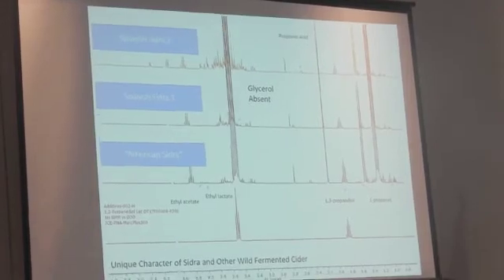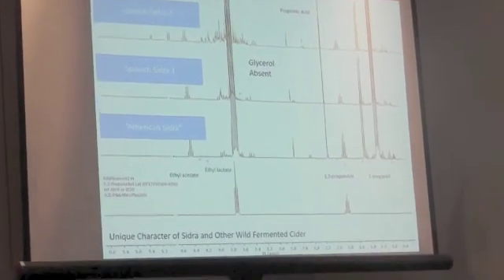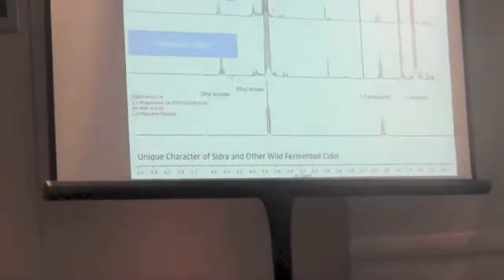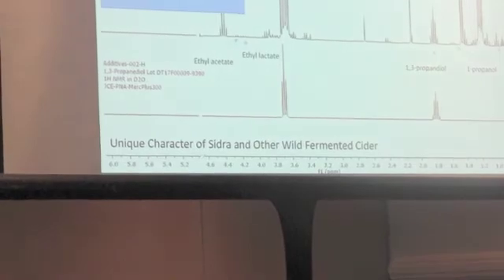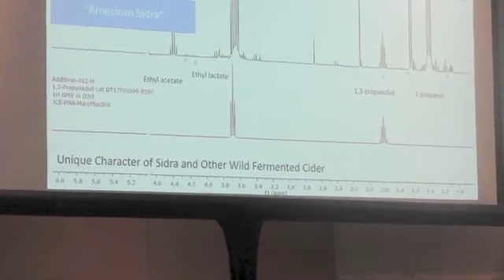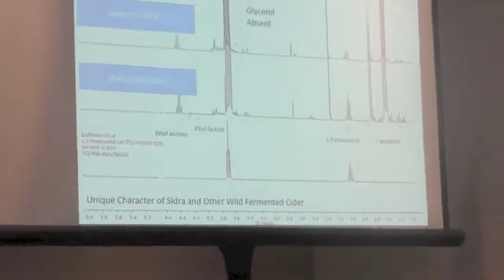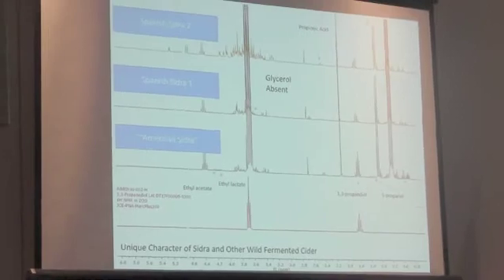And there's talk about a dryness scale that's going to be talked about. Is something like this kind of analysis, where you can see the sugars and you can see the glycerol content, something you could use in parallel with sensory? So glycerol's thick, right, and it sits on your tongue. Could you use it to understand what the dryness is that's in your mouth?